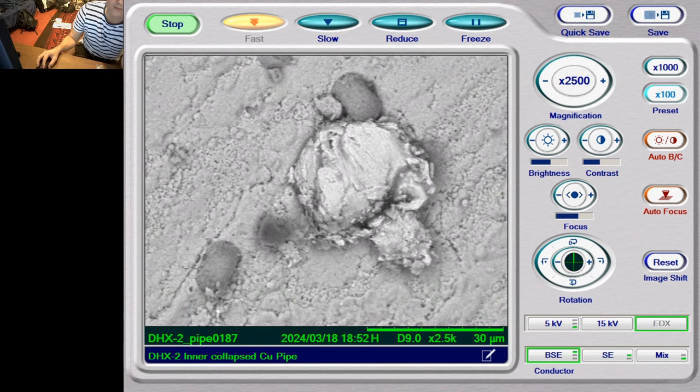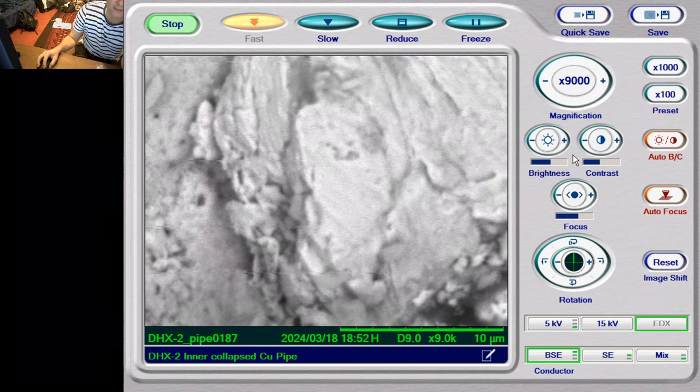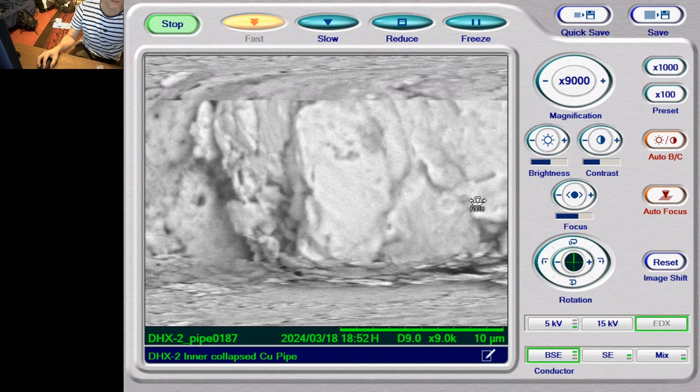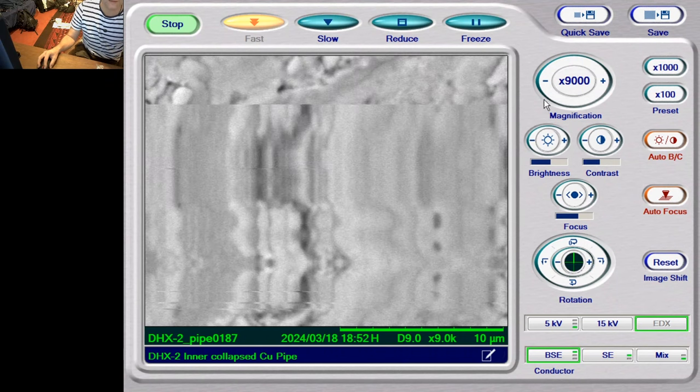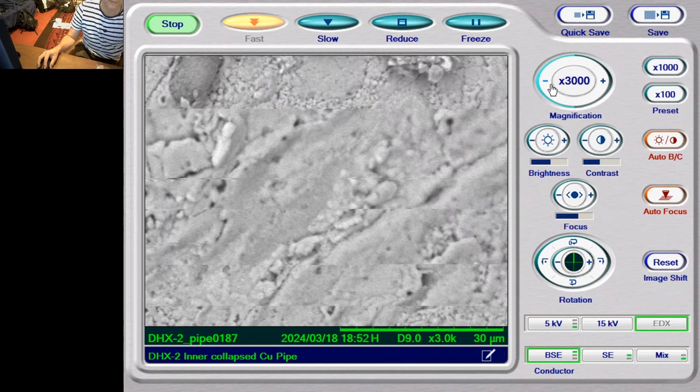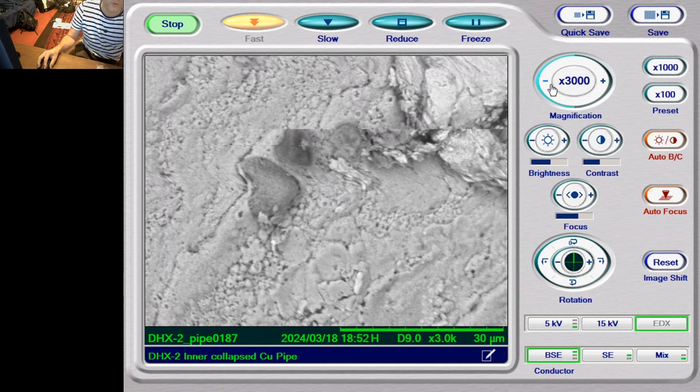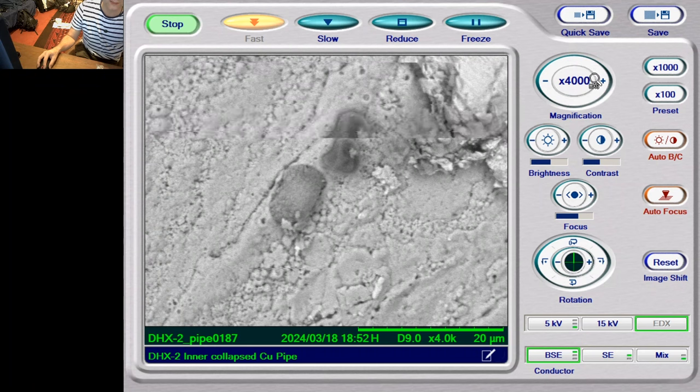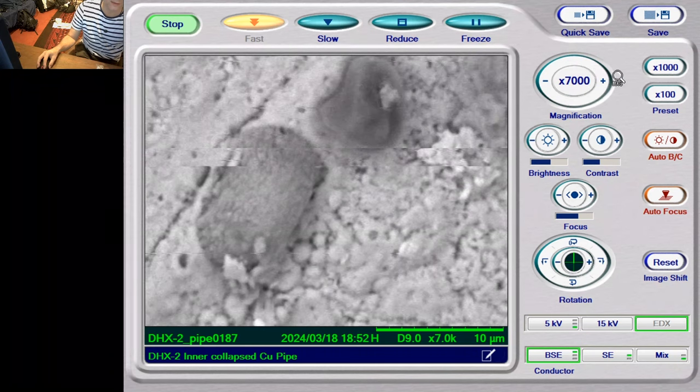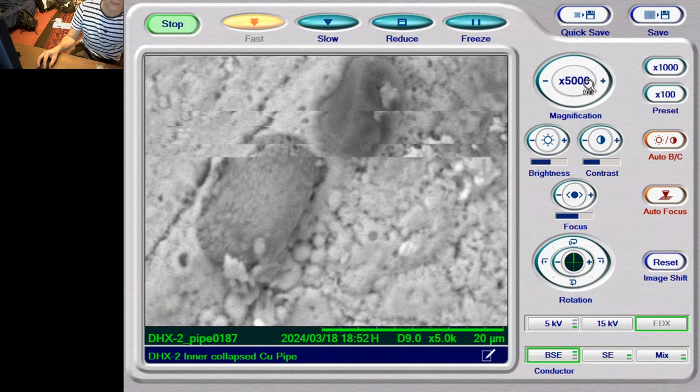The other thing is, these are very smooth examples at this magnification level. They are rather fine. They are rather smooth on the outside. Look at those. They are quite nice for that magnification level.